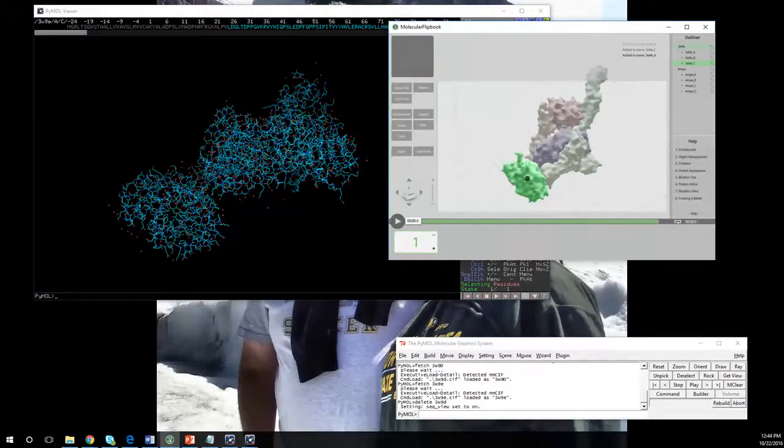On this molecule there is the GD down here. If you look at it you can see that it's labeled, and I'll do this very commonly, as chain C, so the model is 3W9EC. Over here it's 3W9EB, that's the light chain of E317, so that's chain B. And right over here is E317 heavy chain, and that's chain A in this program. So there's 3 chains in this program.